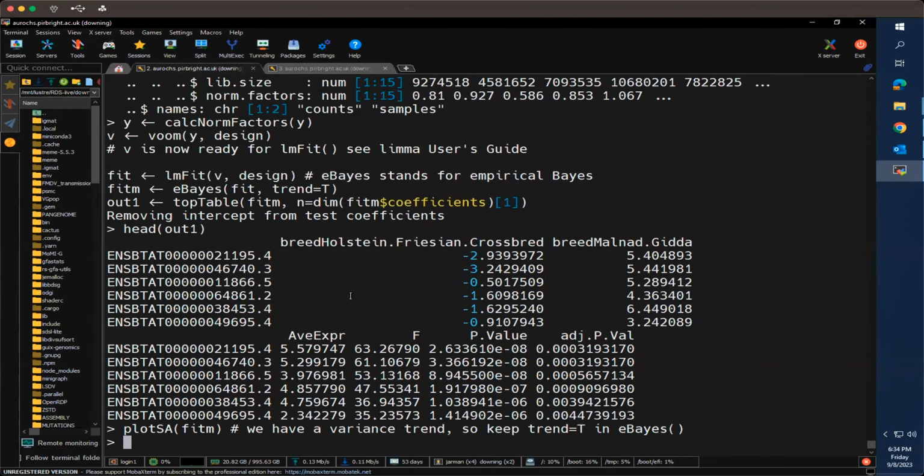So you can see there that we're able to test a range of different things in this single data set, and the best model obviously incorporates the multiple variables together. And you'll note that volcano plots here don't look the same as what we might expect with other data sets because we have quantified the p-values in a slightly different way for this kind of likelihood ratio test, so we don't get the same distribution that we might otherwise get.